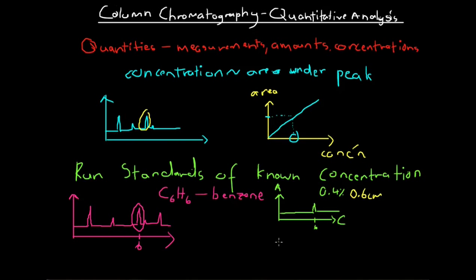So now we've got 2 other samples here. Again, we're going to have another peak after 6 minutes. And this is our 1.1% sample.